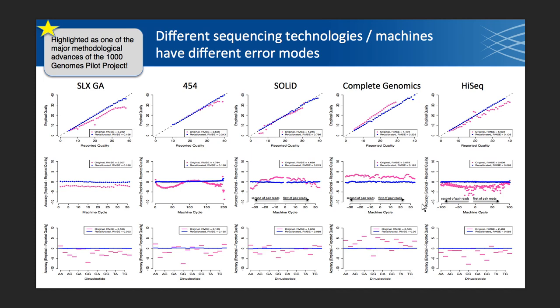For paired-end sequencing, we can see that we underestimate base qualities at the start of the read and overestimate them at the end for SOLiD — or underestimate them at the end for SOLiD. For HiSeq, we have a tendency to overestimate them and then have better base quality assessments towards the end of the reads. At the bottom, I'm showing again the dinucleotide context for each of these sequencing samples, and you can see that this pattern can vary differently between all of these samples on these different sequencing platforms.